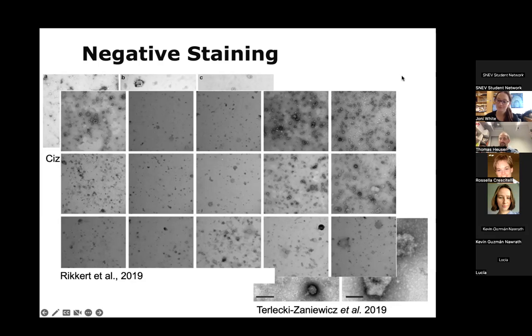These instruments are still very new, so not too many facilities have them, but there are some larger facilities. So for example, in Europe, there is the eBIC at Diamond, which is basically a huge EM facility, and they have some of these quite fancy sample preparation equipment, and the idea is to make this accessible.